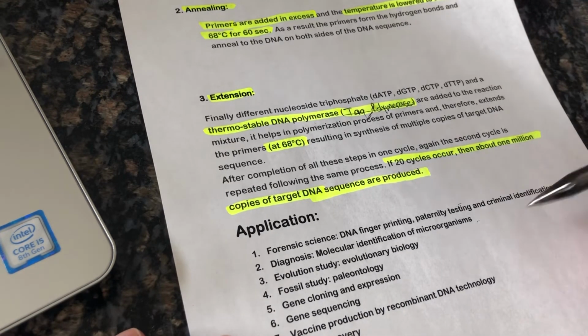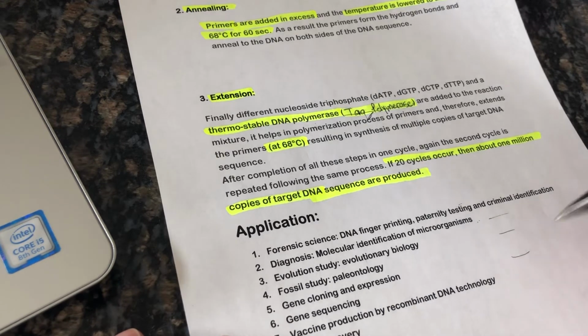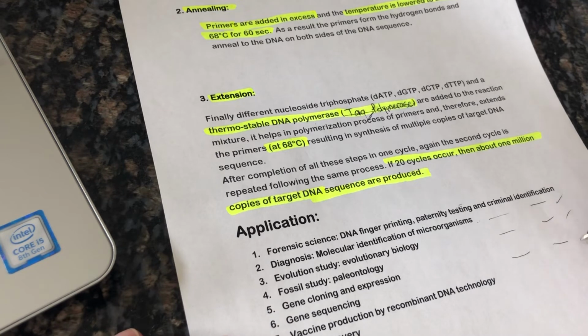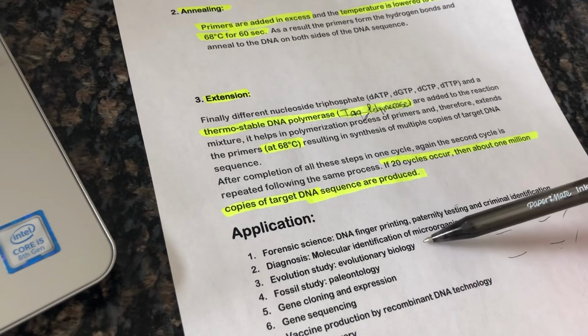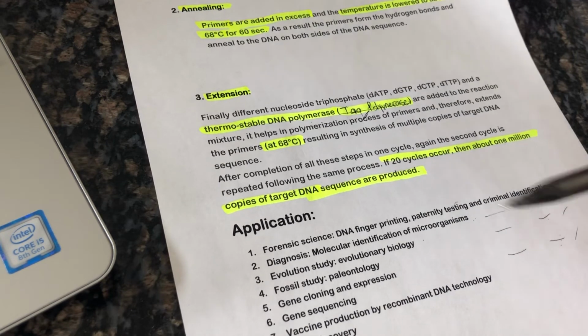So if you think you've got E. coli, it will have certain bands, and then you can amplify your DNA and say, yep, those are the same bands. Now I can see these bands because I have a lot of DNA. How did I get a lot of DNA? I got it from PCR. Studying evolutionary biology, I gave you that example with the deers and looking at the bands.